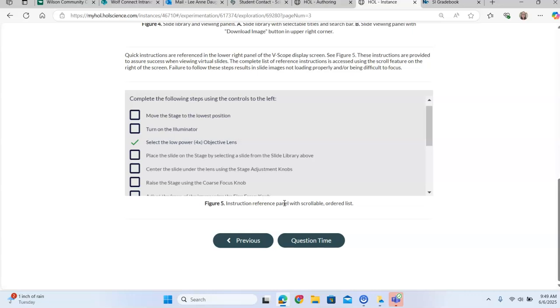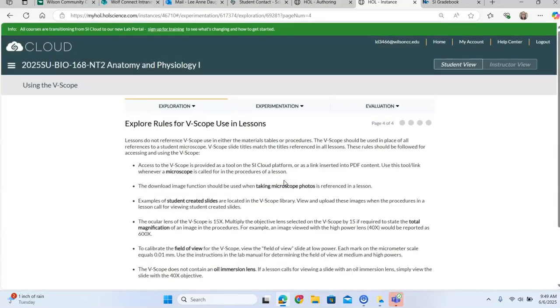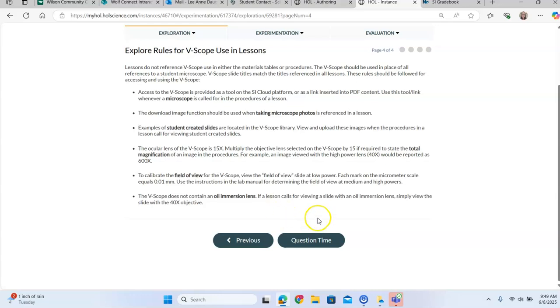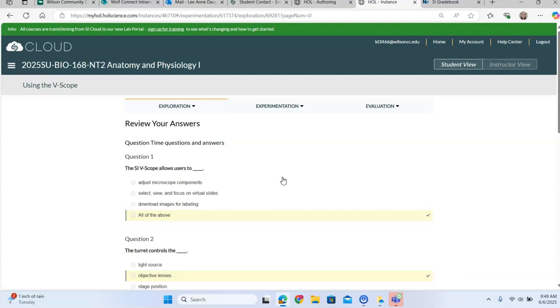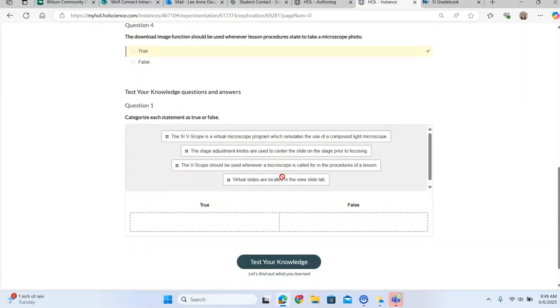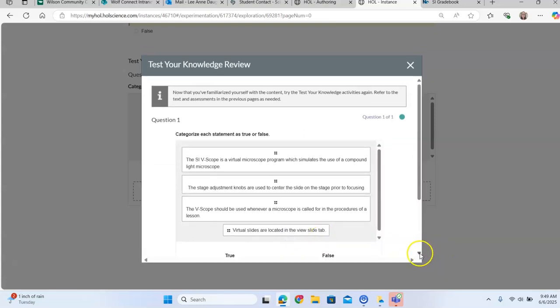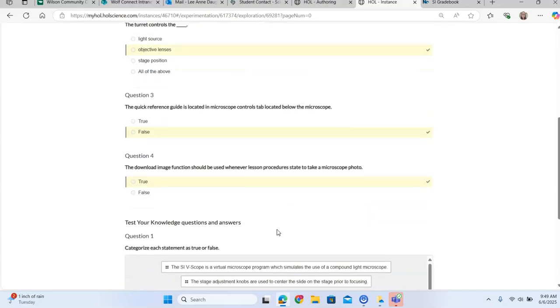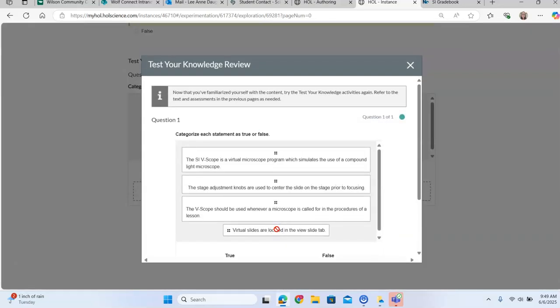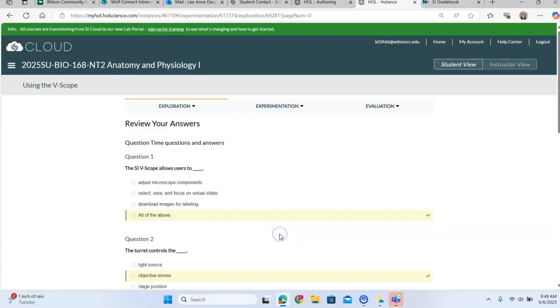Yeah, I've done this before. I didn't have any problems with it. And the other students haven't had problems with it. But that does not mean that a new problem hasn't come up, because all this lab has been this summer is problems. I think it may be safe to say that we won't be ordering this lab kit anymore, but we have, so we kind of have to deal with it.